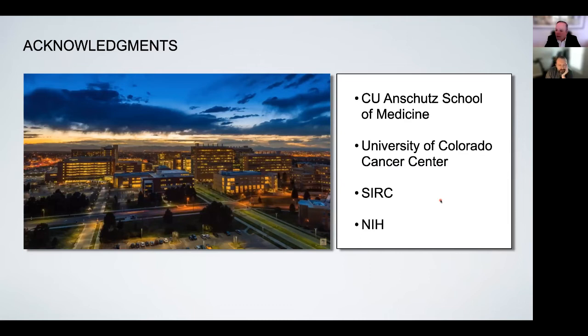Yes, absolutely. The other question I had, and this is my naivete with technology, but in terms of protein interactions, so if we had two proteins that we expected would be interacting, or a protein complex with another single protein, how is CryoEM suited for that, or should I be looking somewhere else?